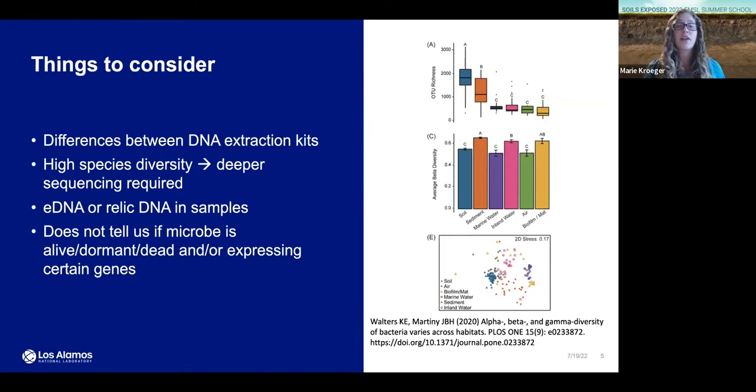And if I don't have a deep enough metagenome, then I'm not even going to be able to do any sort of statistical analyses looking at my different genes associated with methane-cycling. So it's really important consideration.